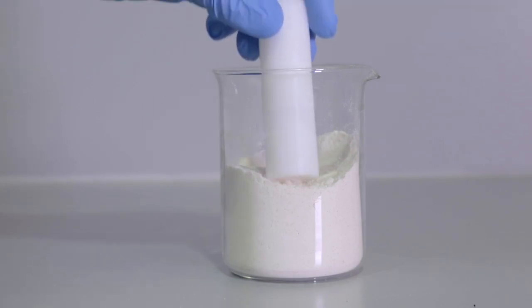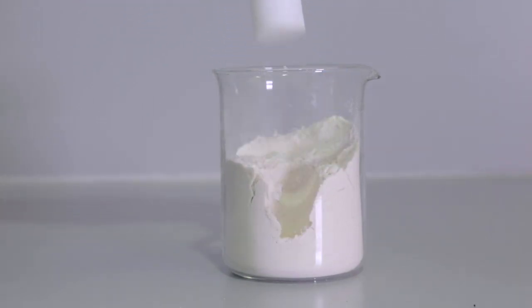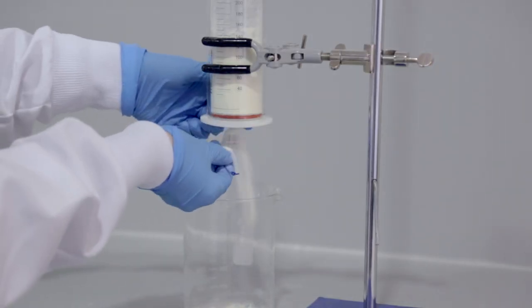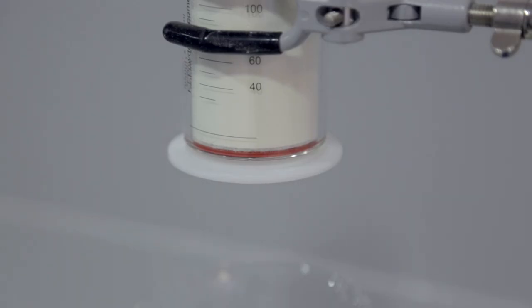If we contrast the ceramic to a flour and put them through the same experiments, you can see in a confined state the flour displaces out of the way and allows the forced flow regime to cause it to move. Put that same cohesive system into an unconfined environment, open the valve and very little flow occurs because it's not suited to unconfined flow conditions.